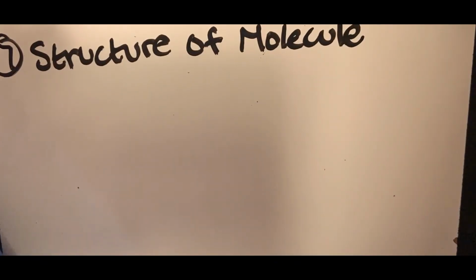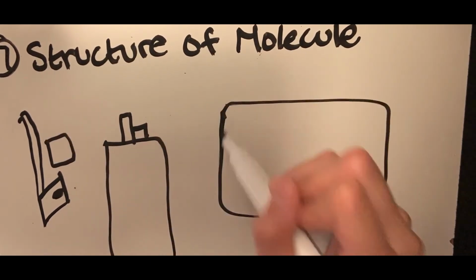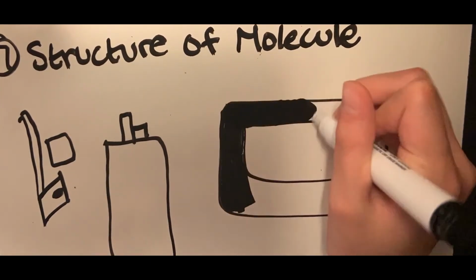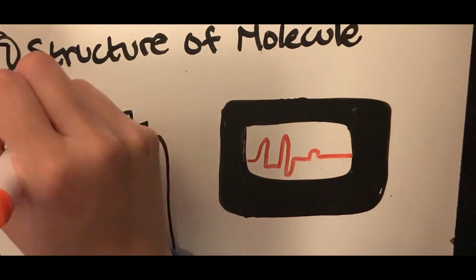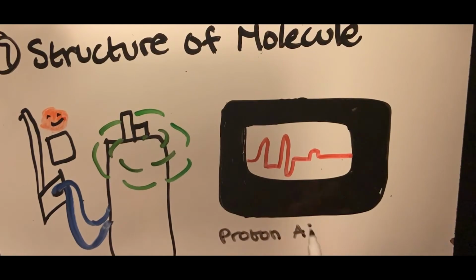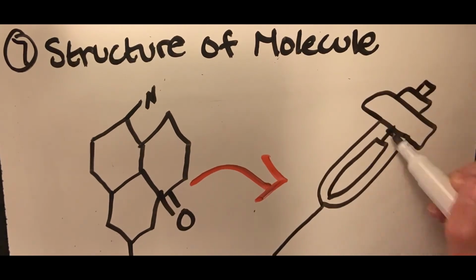But even though we know the mass of a molecule, we still need to find out the structure. This can be done by a very powerful tool called nuclear magnetic resonance, or just NMR. NMR finds the nuclear spins of a molecule using a big magnet, and based on the spins, we can figure out how a molecule is organized. Doing all these steps, we can take this molecule and put it into medicine that's useful for helping people all over the world.